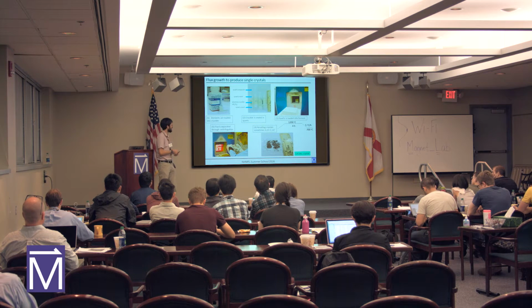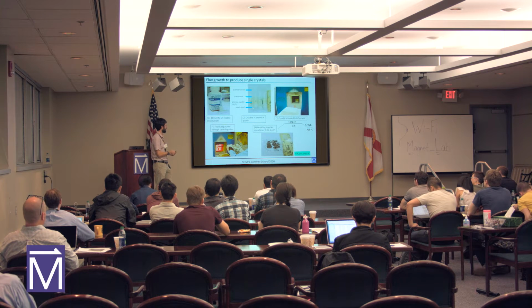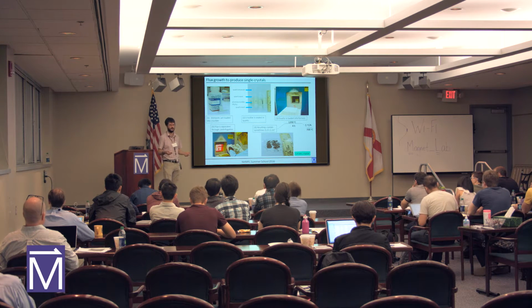What you do then, and I should say too, is that you want to think about what type of crucible you're using, and even if you really need a crucible. Some fluxes that you might use don't have any bad effect on quartz, and I can help you to know the details of that. So for instance, zinc doesn't care at all about quartz, or quartz doesn't care at all about zinc, so it's totally safe. But indium, I think it's better to put it in an alumina crucible.